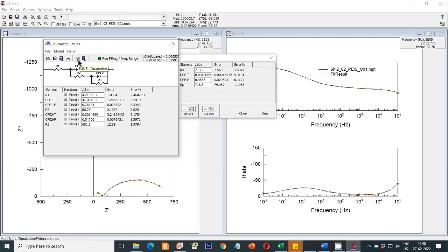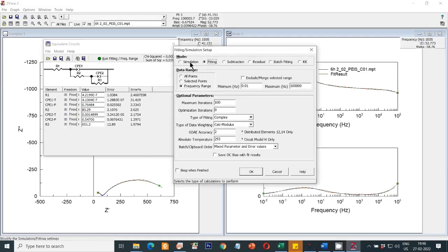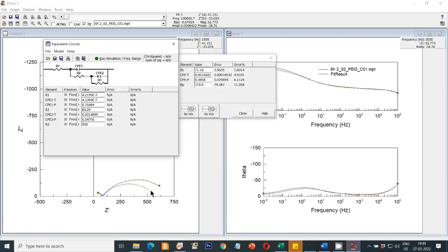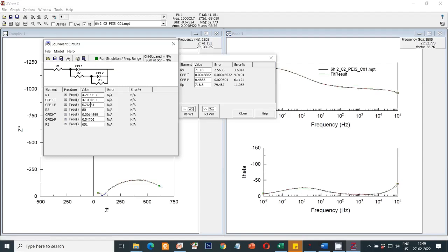If the fitting is not perfect, go back to Edit Parameters and this time select the Simulation option instead of the Fitting option. If you change the parameter values, the graph will change accordingly. For example, I changed a value to 500 and ran the simulation — the graph changed. I'll put it back to the original value. Now let's change R2 from 80 to 100 — you can see a shift happening. Put it back to 80. You continue to change parameter values until the fitting is perfect.